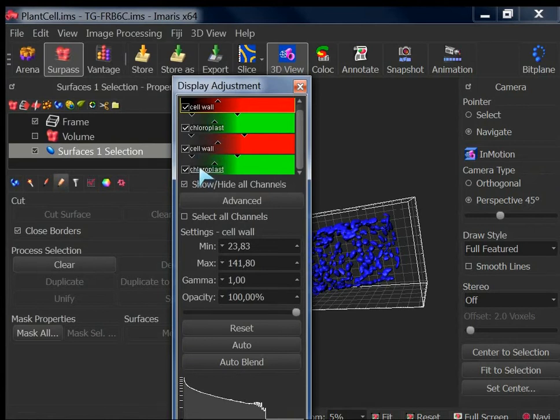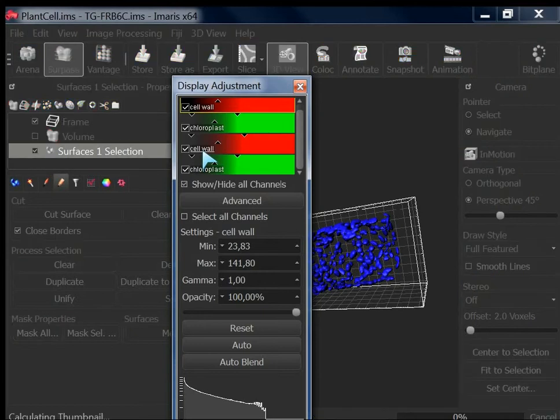So which one is which one? It's last in, first out strategy, meaning whatever you see last, down below, that would be the recent one. First is always older, so it starts from top to bottom. But to get rid of this confusion, maybe it's better practice to click here and change the name.